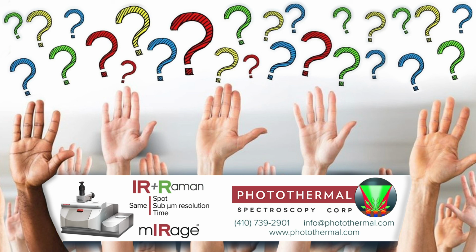So for tissues, I think it'll work really well. In fact, I know Kathy Goff has published a little bit on that as well from Canada. But the work that I did looked at thin single cells, which are probably 1 or 2 microns. And so when you're working at that thickness, glass does have a silicate peak which comes through.